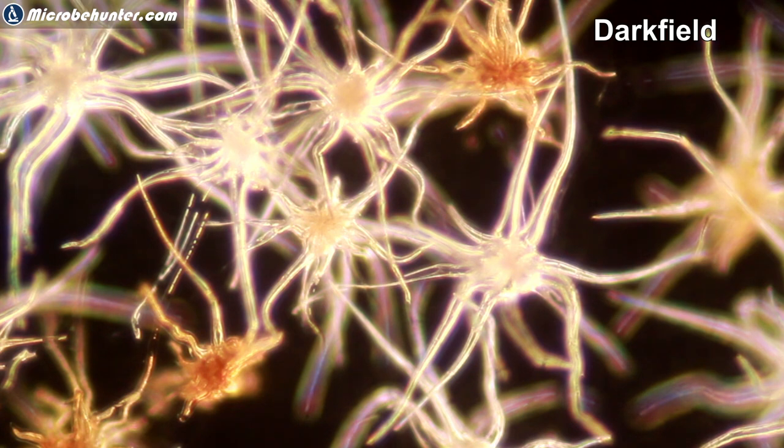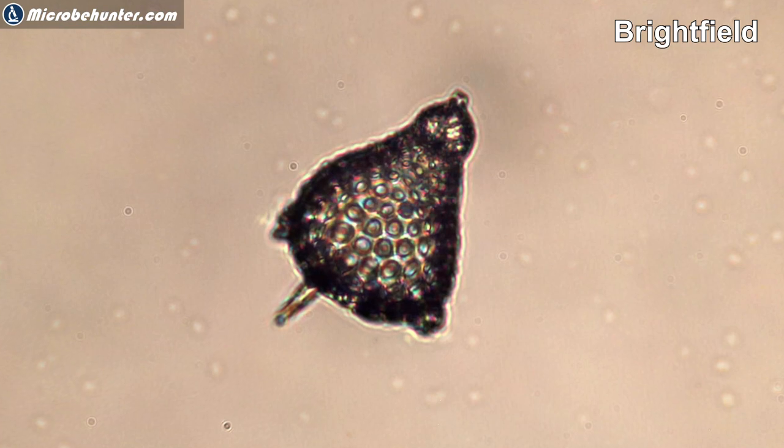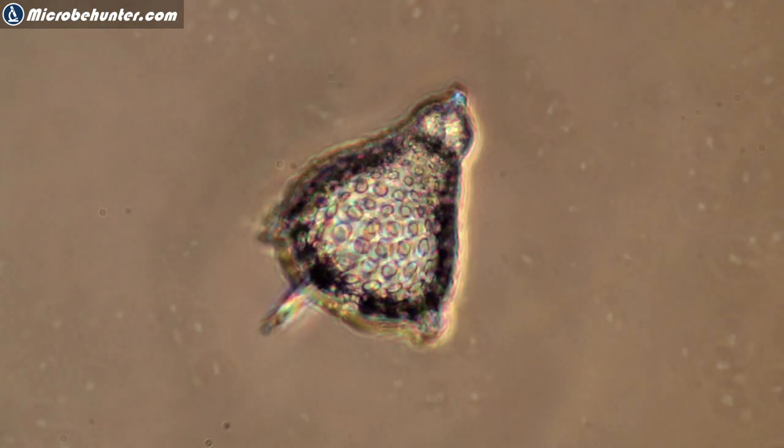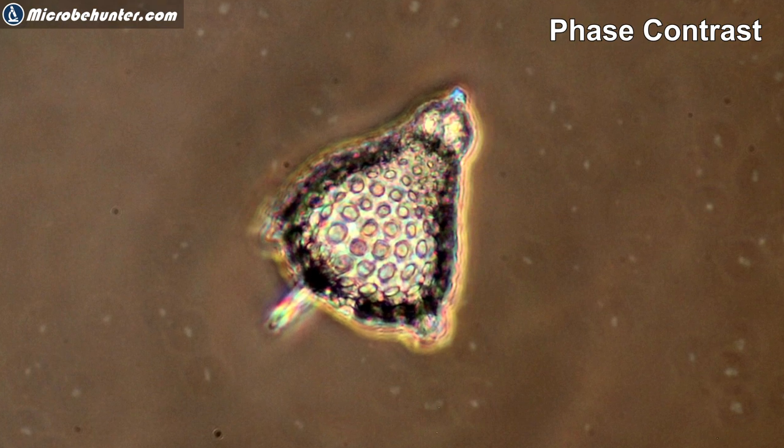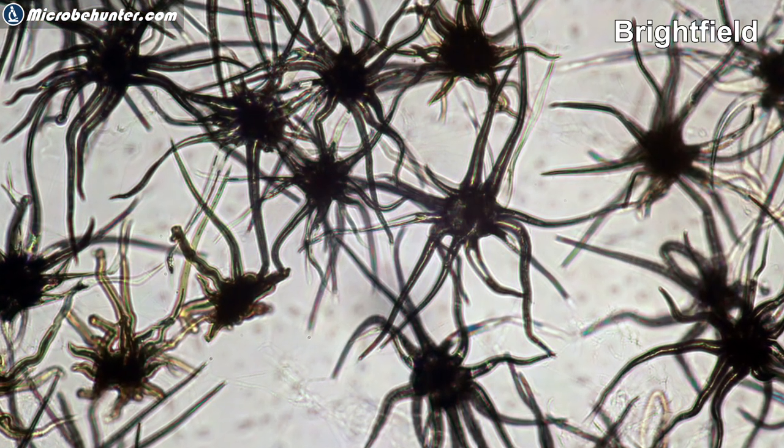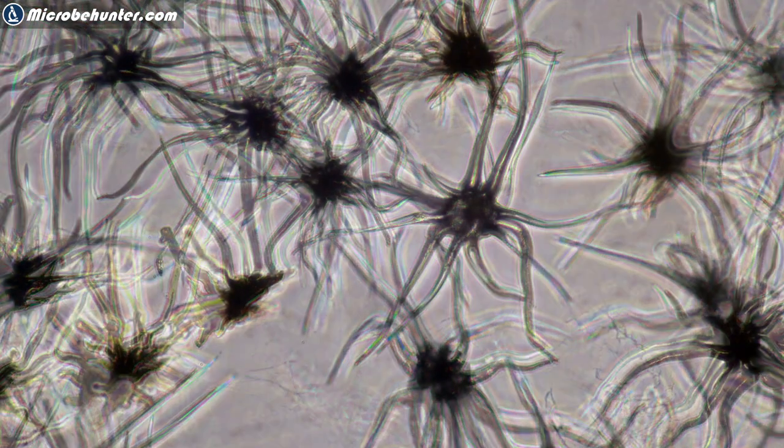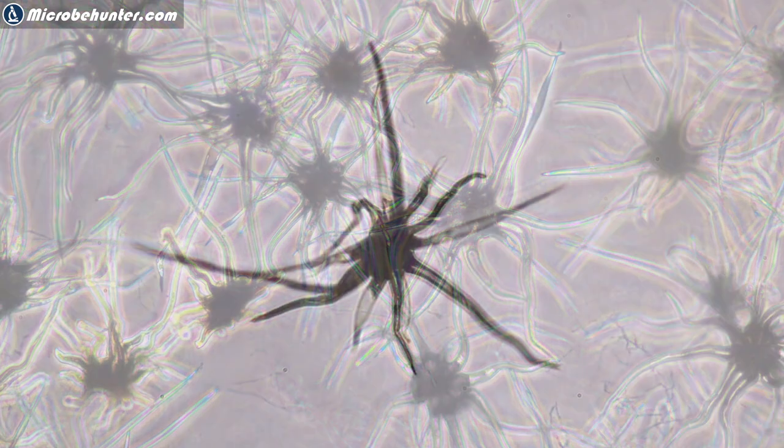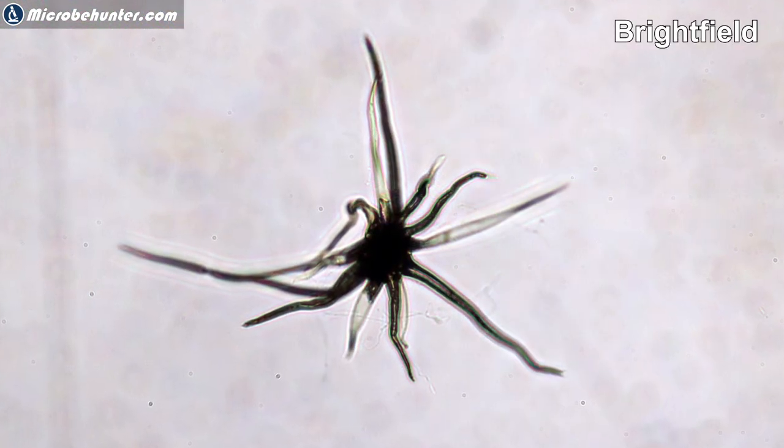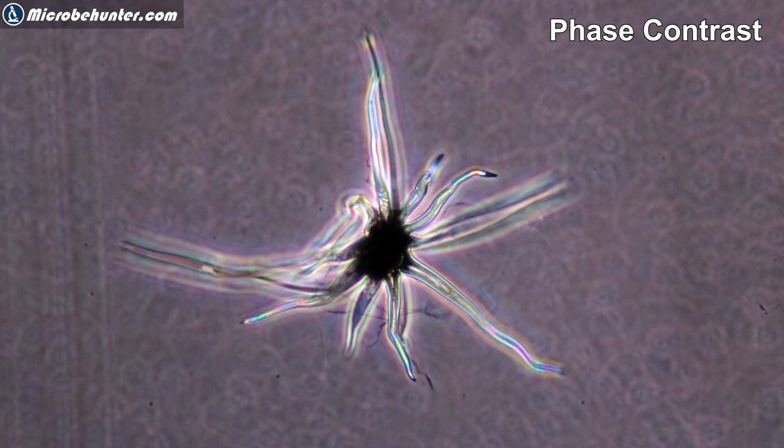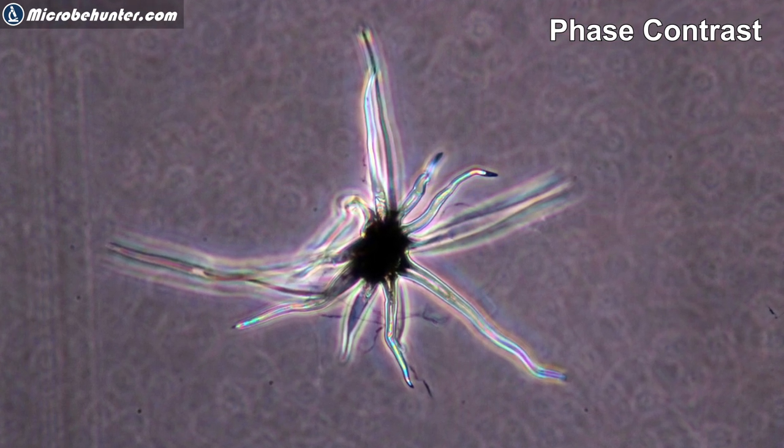The idea with phase contrast is you have to understand that not all specimens are suitable. There are certain specimens that simply work better than others. Phase contrast does take color away a little bit because it superimposes brightness and darkness. Therefore, the actual color goes away a little bit, the natural color. But that's something that you simply have to be aware of. But certain structures are much better visible.